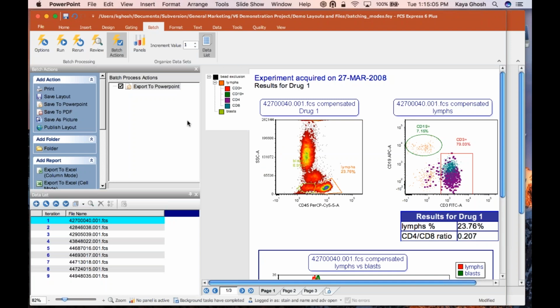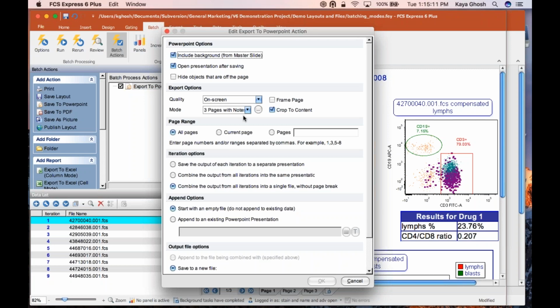Okay, let's take a look at another option here. So rather than using these preset options, and by the way, you'll see a number of other options in here, like horizontal, vertical. That just refers to the order in which the exports are printed onto the slide or the PDF or the printed page.